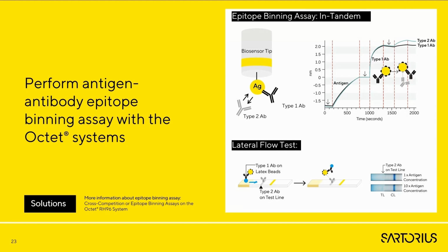The type 1 antibodies were coupled on the beads and bound to the antigen in the sample pads. Binding was fast and resulted in a stable antigen-antibody complex. Once the antigens bound to the type 1 antibody, the epitope for type 2 antibody was hardly accessible. The resulting sandwich formation occurred to a lesser extent and resulted in a weak signal, even at 10 times more antigen concentration.